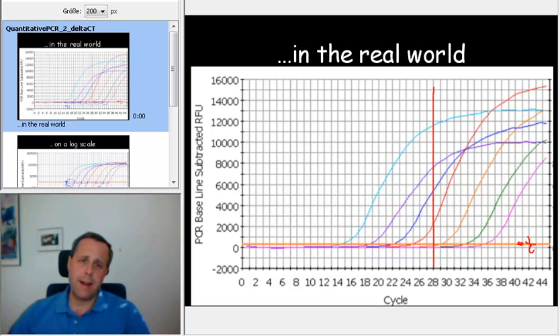So if I try to draw this, I can try that, but it's not real easy. I still try to do that for you. So this here would be one delta CT. The delta CT between the light blue and the violet line next to it. So that's one of the delta CTs. Here we have another delta CT, here we have another delta CT, and so on and so forth. And if you tell me that you can't quite accurately see where exactly the lines would cross the threshold, you're perfectly right.